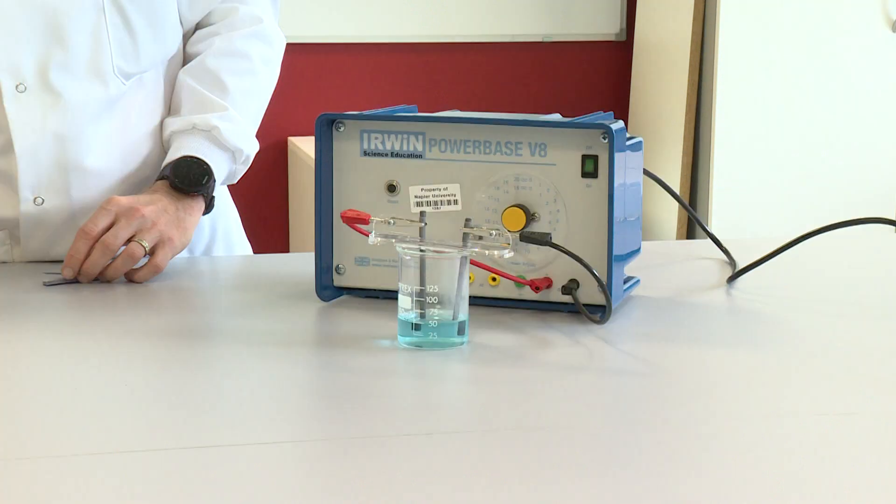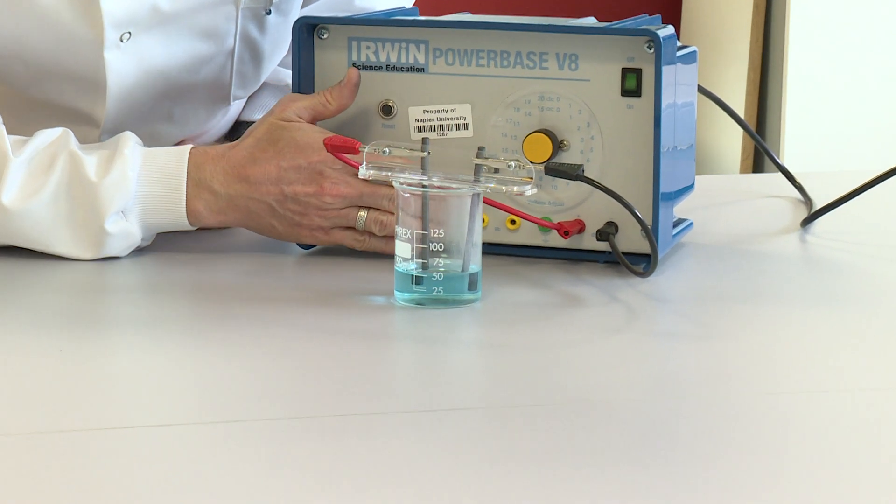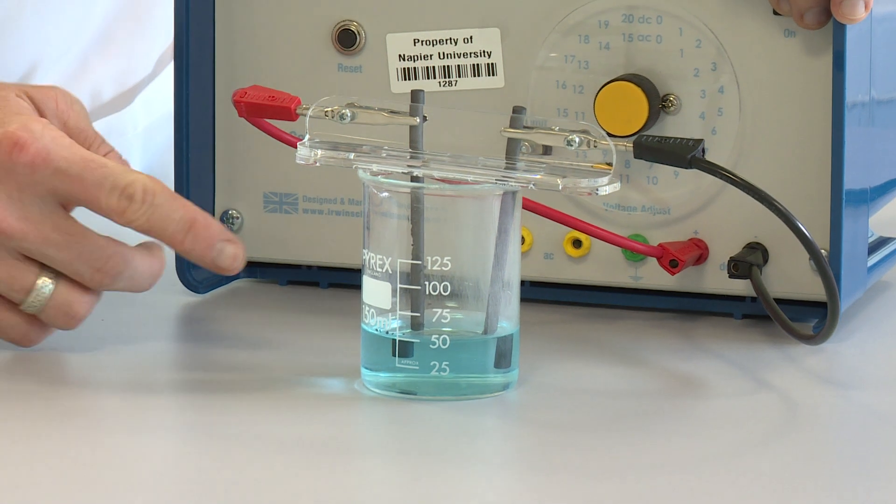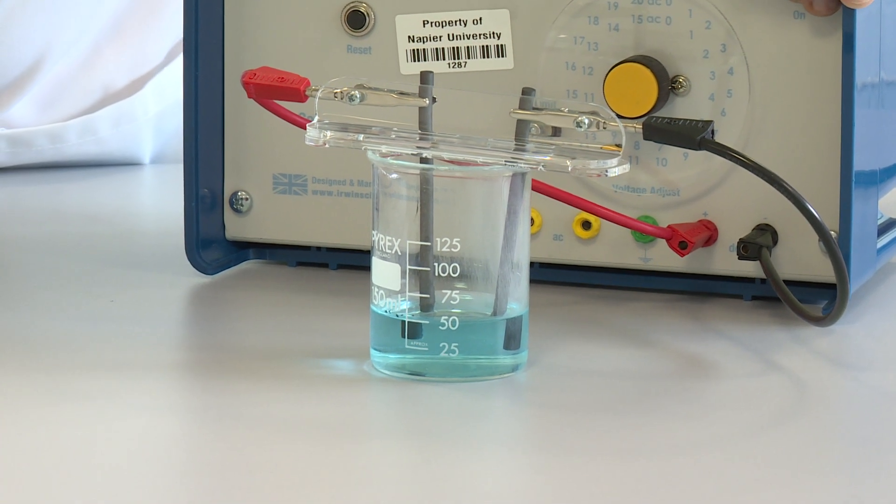We have got the power supply set to 12 volts and I'm now going to turn on the power supply. We're looking to observe any changes that happen at each electrode.